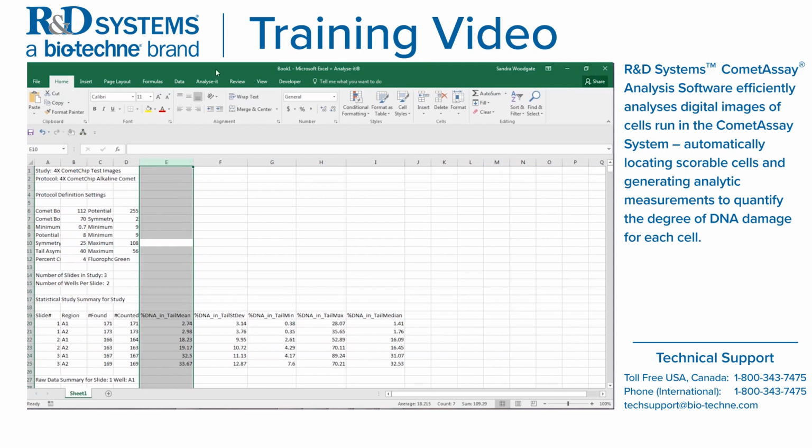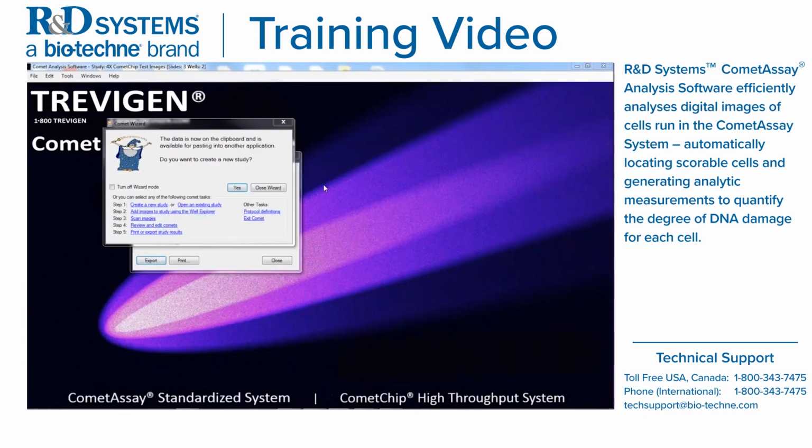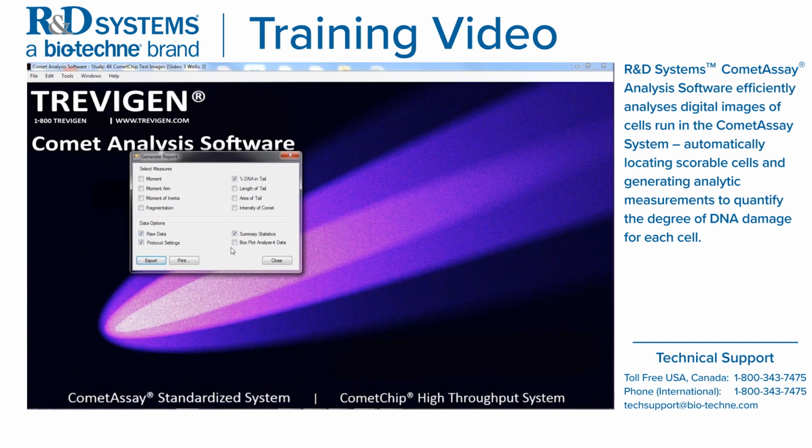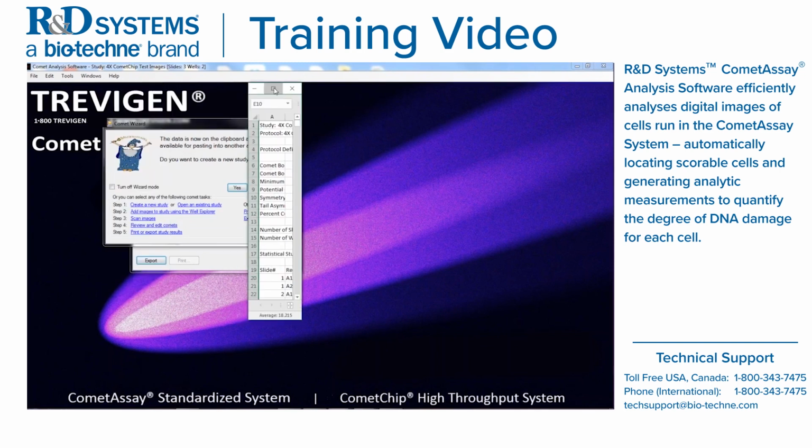Okay, so let's now go back and say we want to export our data in order to do a box plot. You can select percent DNA in the tail box plot. Now we're going to export. Again, the data is on the clipboard, so we want to paste it. Let's just pick another sheet here.